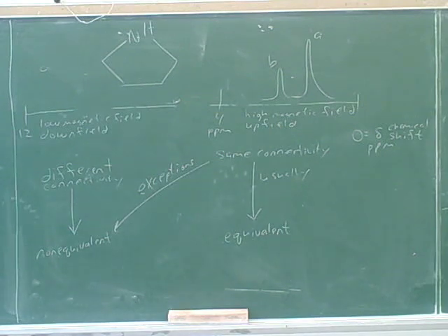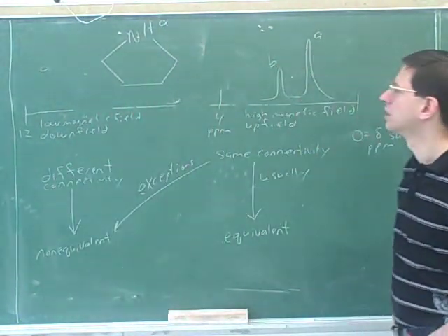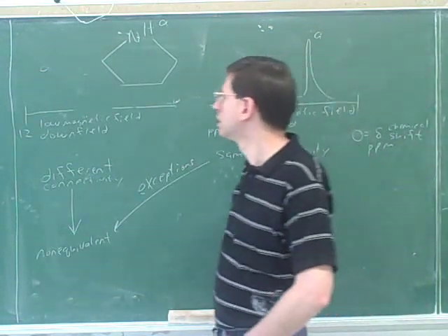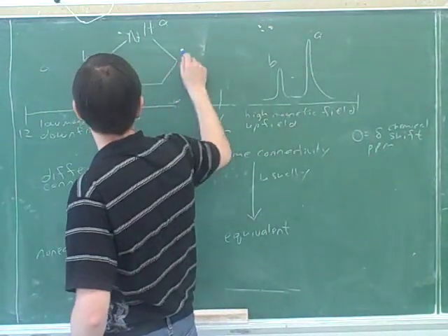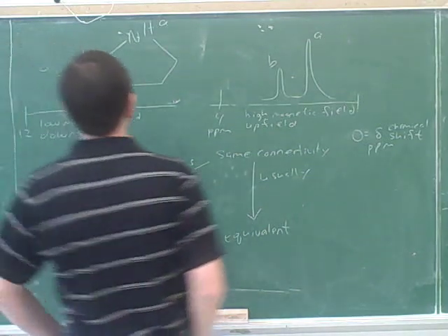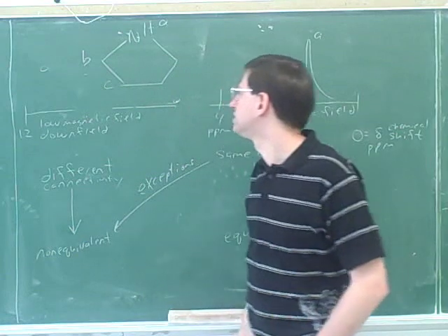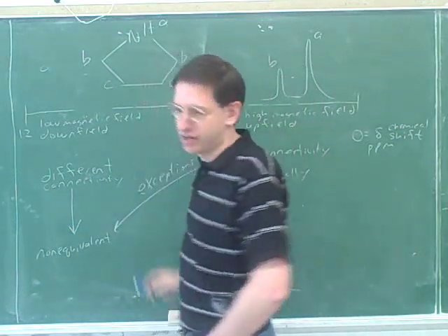The hydrogen at the very top will be A. Good. The hydrogens on the carbons most closely to the end are going to be B. Good. And then, using the method used for the previous problem, I would say that the ones on the bottom are C. So how many peaks? 3. Because the left and the right hand sides are equivalent.